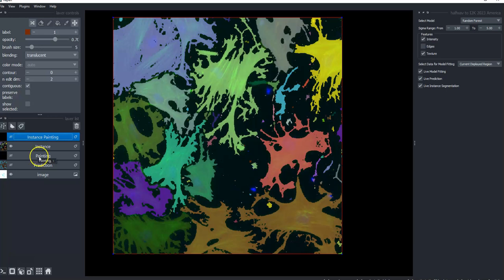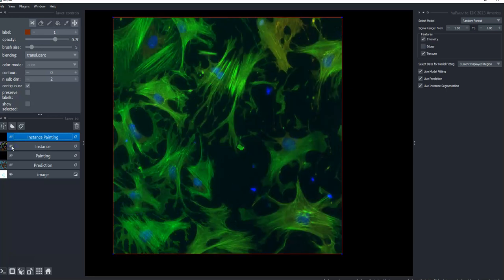And probably again, if you weren't just making a video to demonstrate a tool and you were doing it for your real project, you'd spend more time. But we're showing here how you could potentially use machine learning to aid your labeling, and this is what we got. We can make more corrections, make it better and everything, but maybe machine learning is a potential way to accelerate your labeling for this problem.